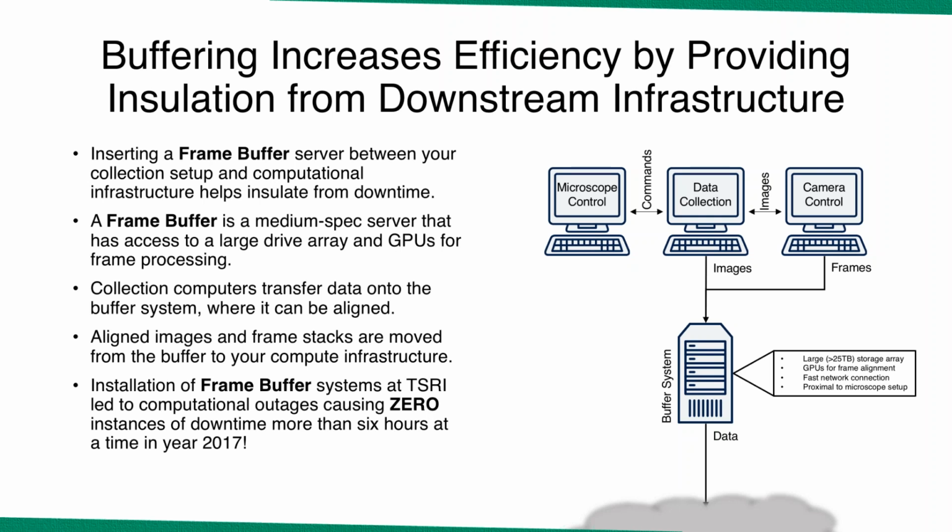I will say that installation of a buffer system behind every detector and microscope at Scripps has led to the phenomenal figure of 0 instances of downtime more than 6 hours in the entire year of 2017 last year. So I can really speak to the power of these buffer systems and keeping your facility running and constantly churning out data. Feel free to ask questions about that later.